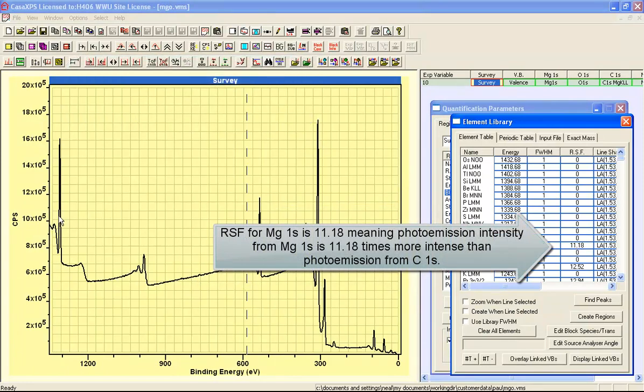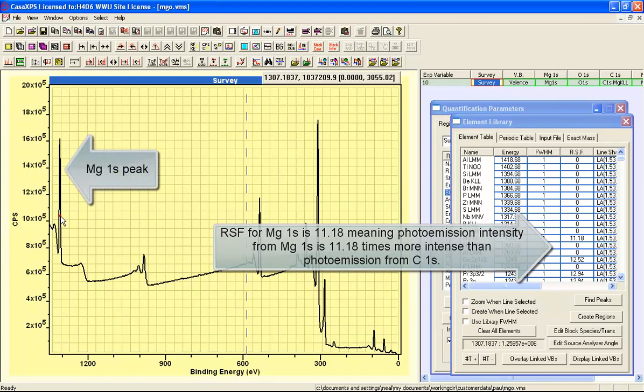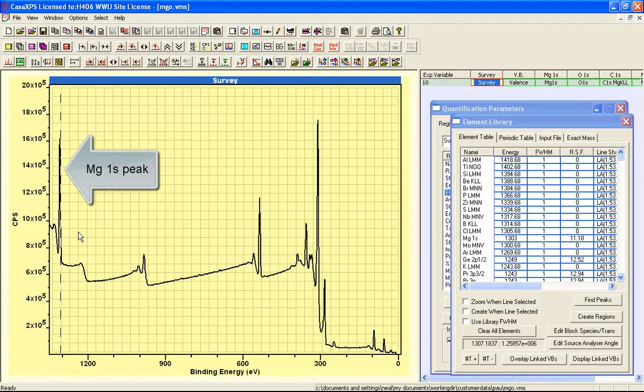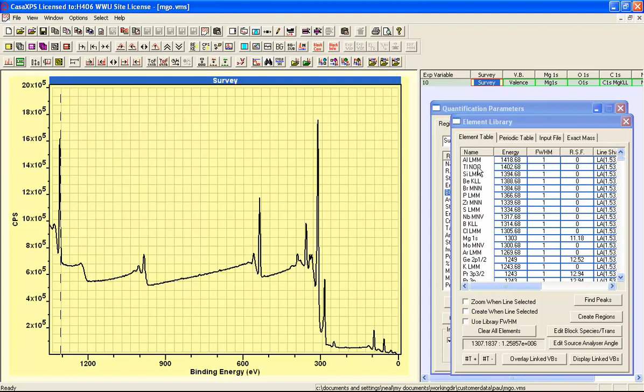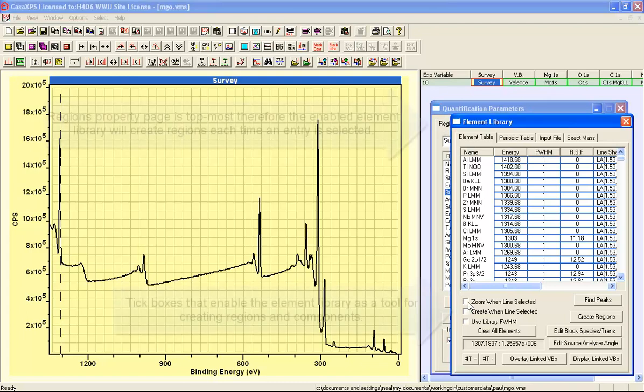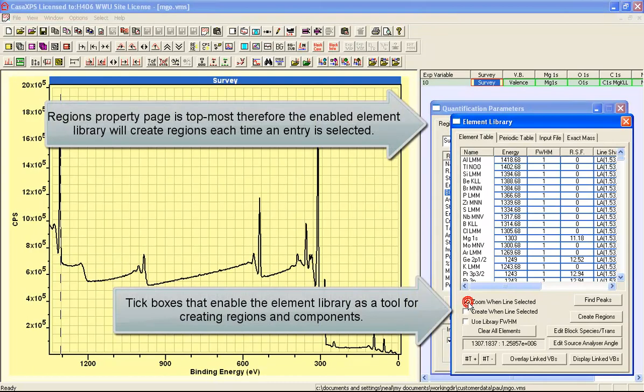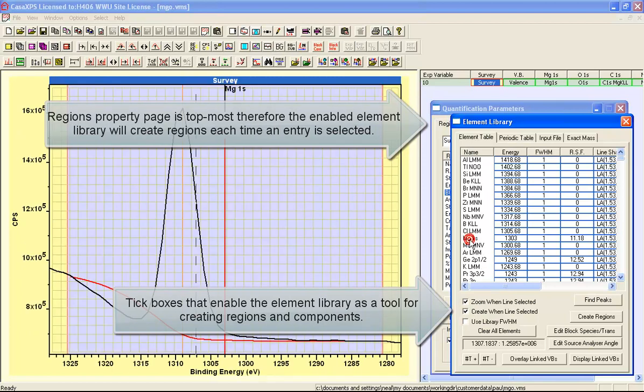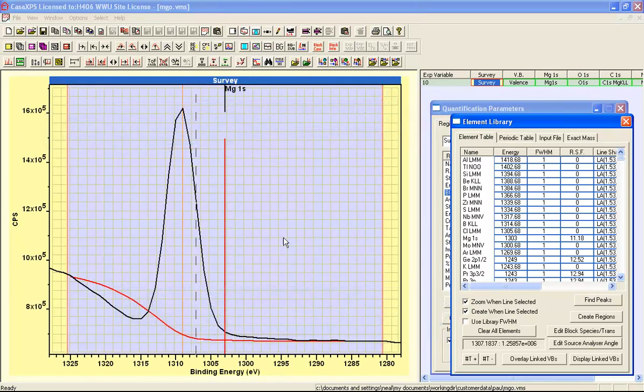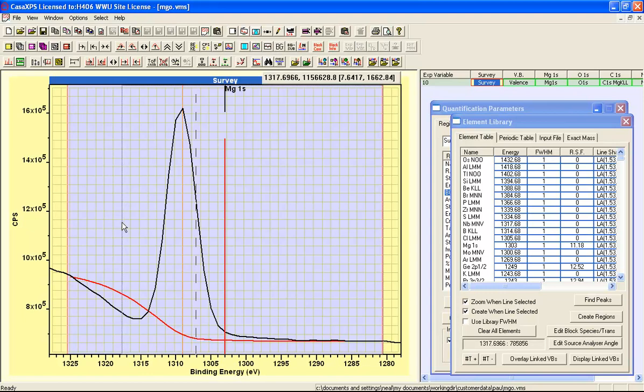So this corresponds to the intensity that we would expect this magnesium 1s peak to appear at relative to a carbon 1s, which is set with a relative sensitivity factor of unity. So having invoked the quantification parameters dialog window, the regions property page topmost, if I select the zoom when lines selected and create when lines selected and I click on the magnesium 1s, then a region is created.